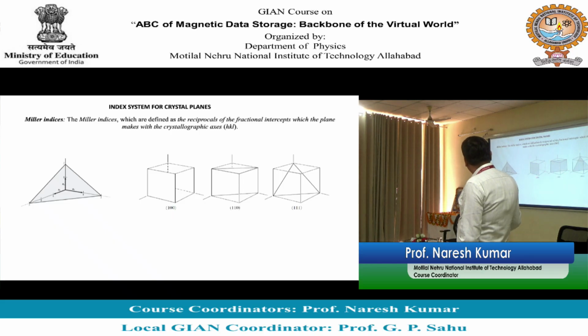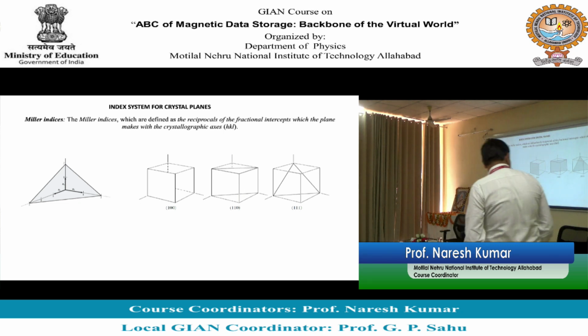So here, if you see, if this is x, this is y, this is z, then this is my 100 plane. If this is x, this is y, this is z, this is my 110 plane. This is my 111 plane, and then you can create these planes.